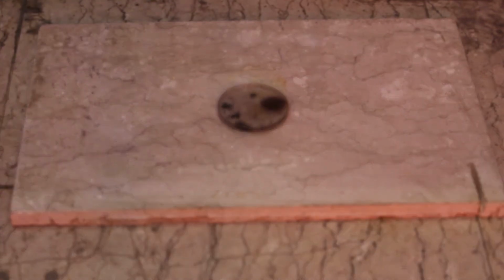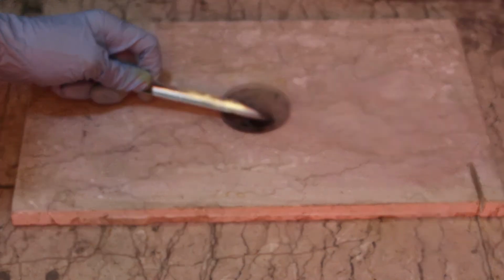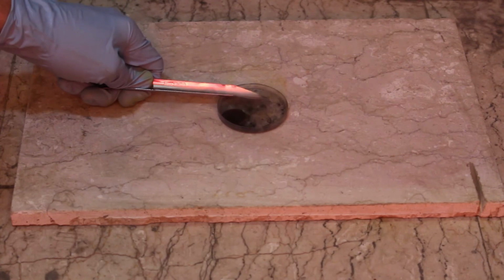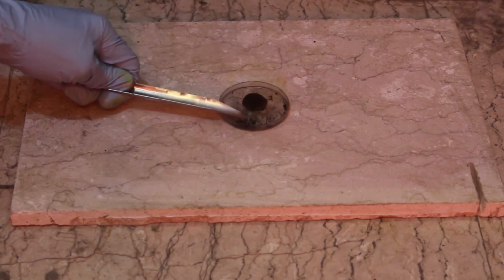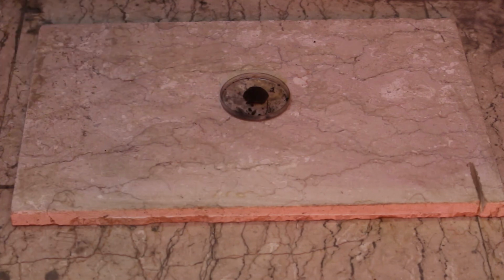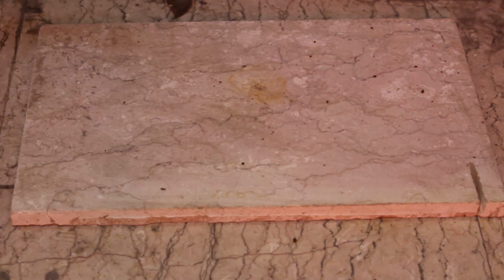Now that I knew the temperature of the container was about minus 196 degrees Celsius, with a lab scoop, I gradually increased the pressure applied on it, until a small pop. As I said, of course, the stability was increased. When the liquid nitrogen completely evaporated, I noticed that the nitrogen triiodide had preserved its explosive properties.